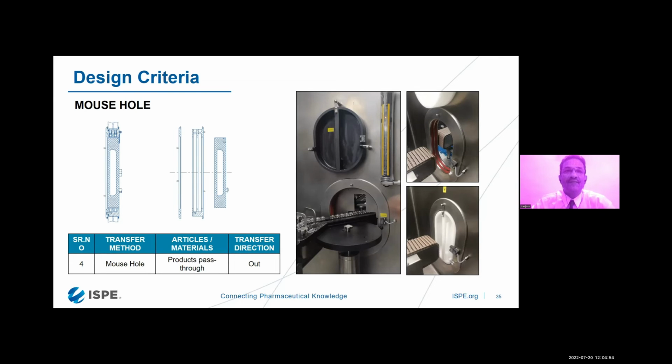one vial line with a lyophilizer system can connect to one vial lyophilizer system. It can also connect in series to 4 lyophilizers with the help of a row-by-row system, which forms a combing device for the vials in front of the chamber table. And at the constant loading height, when the shelves collapse, you push the vials onto the shelf for doing the lyophilization activity.